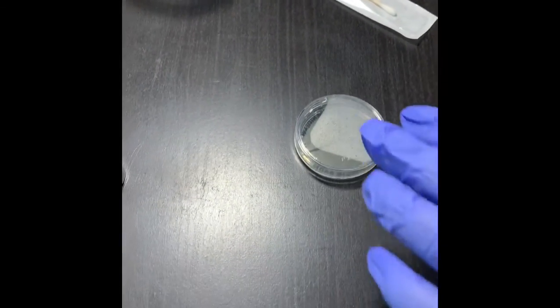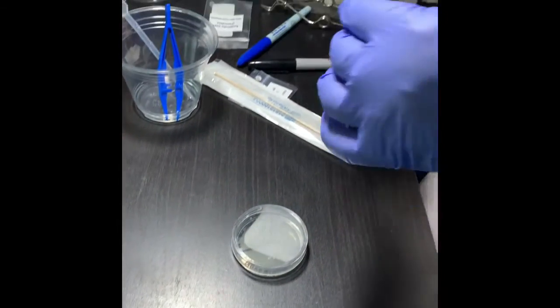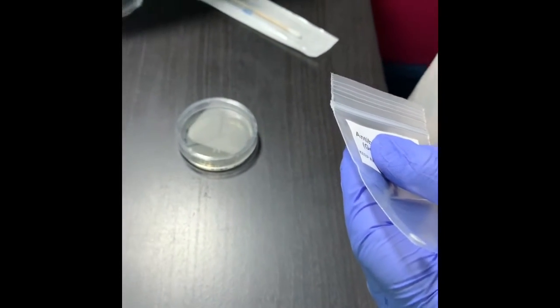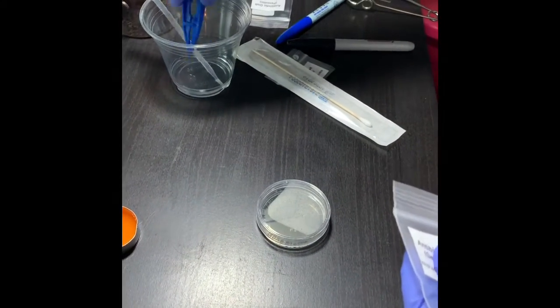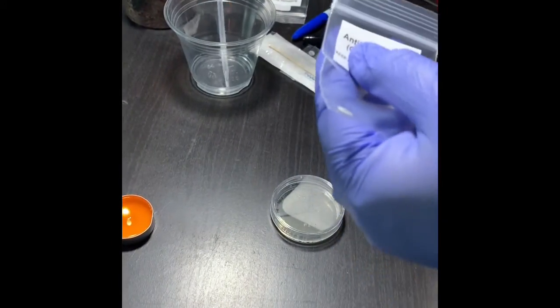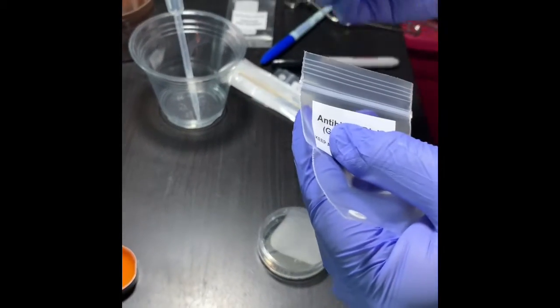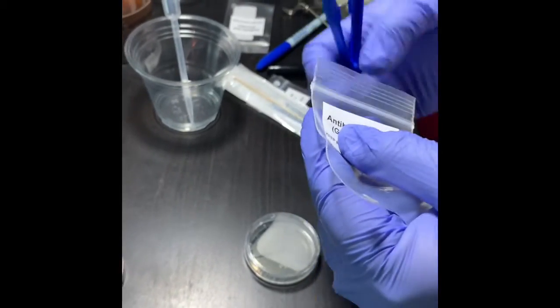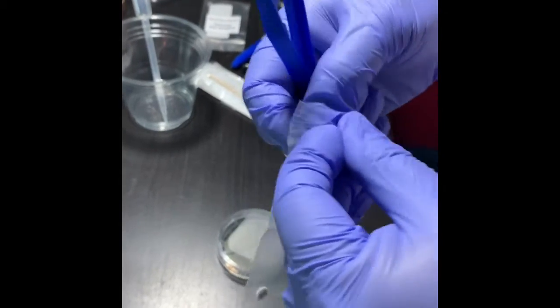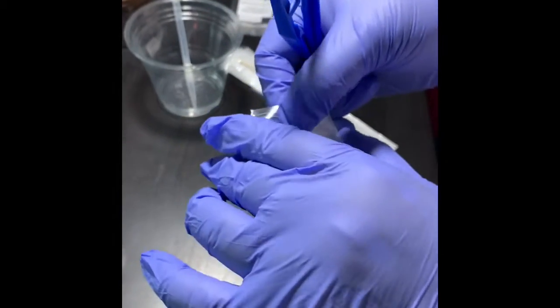Now I have to put the antibiotic tablets over here as mentioned. You see my tweezer is already sterilized in alcohol, so I'll get rid of the excess alcohol, and then take the antibiotic tablet from the small packet they have provided. This one is gentamicin.